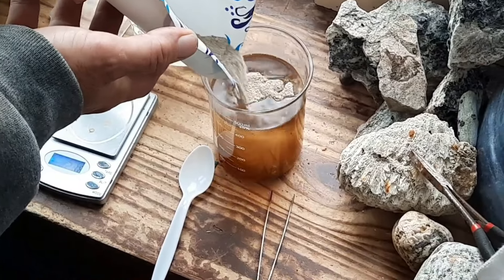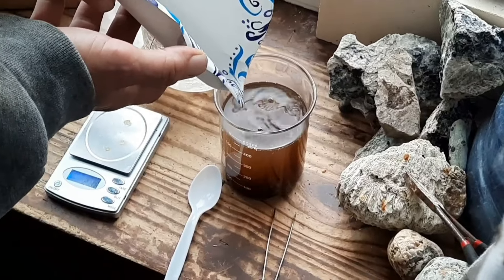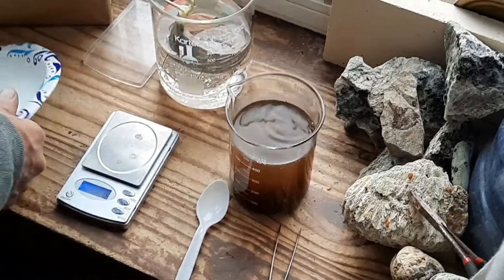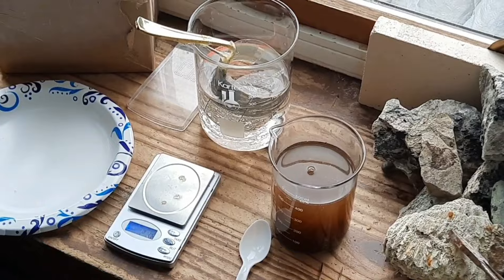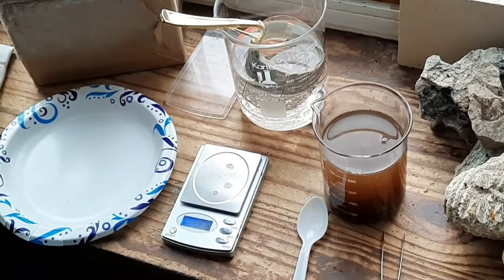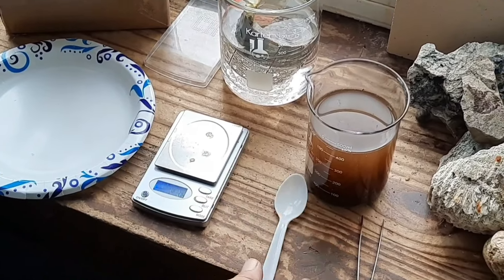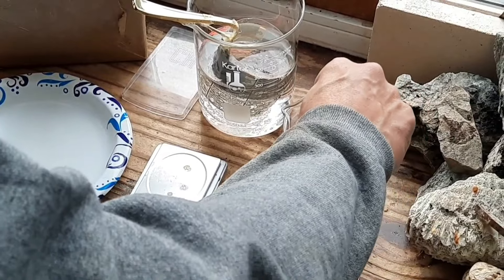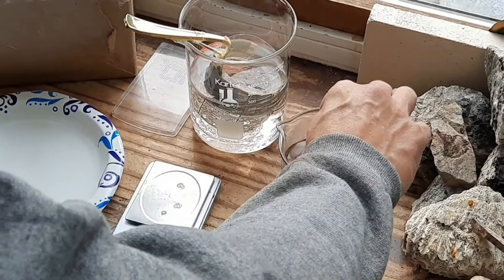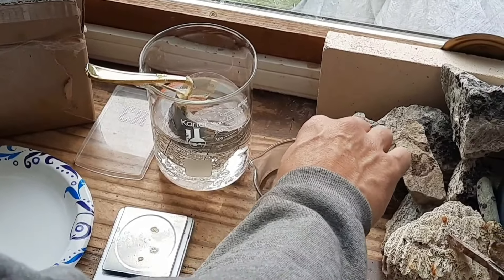Now I've got to stir this around, and this time I'm going to filter the solution. I'm right next to a window area so I open my window a little bit to let any debris out. I'm going to stir this around until everything's dissolved, and then once it's all stirred up we're going to filter it out so we have a nice clean solution. We'll be right back.